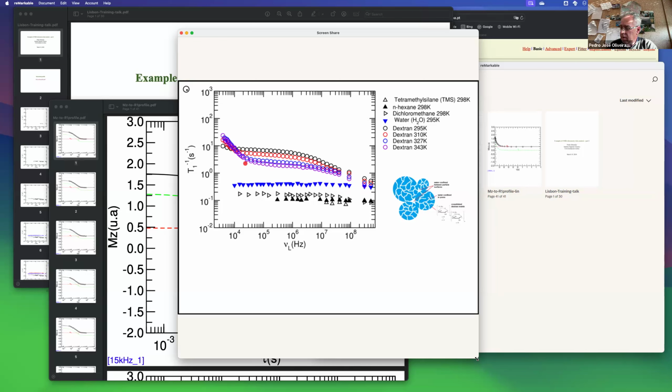So water, the profile that we observe, which is the behavior of water in these confined spaces, the dispersion that we get becomes closer to this dispersion of water that we have in bulk water. So water confined in narrow spaces produces some dispersion that is completely different from the bulk behavior.